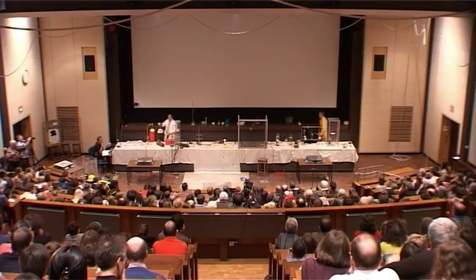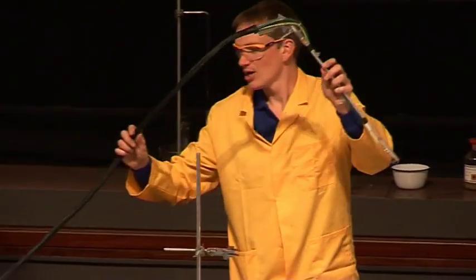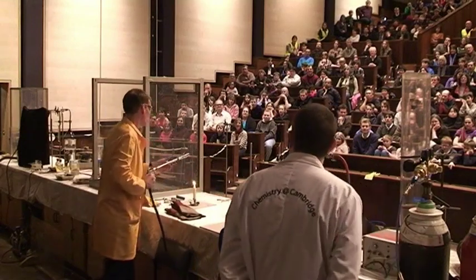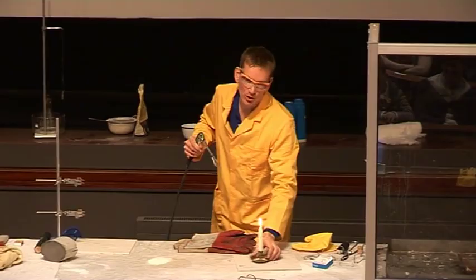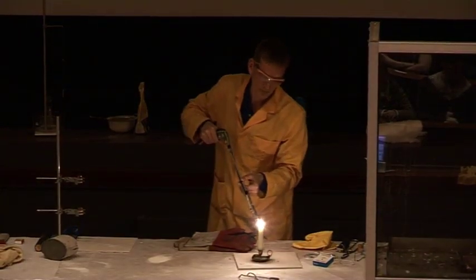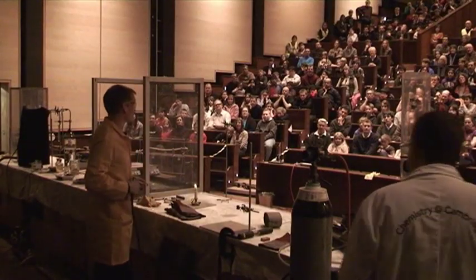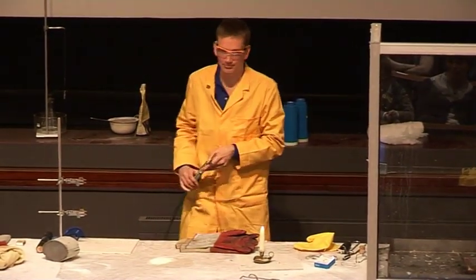Now, we have over here a special gun that will come in very handy later. And when I pull the trigger here, gas comes out. It's pure oxygen gas, and I'm going to see if I can light it. So let's try and light it with a candle. Well, it certainly doesn't light, but what it should be able to do is help the candle burn a bit more brightly. So the oxygen itself is not catching fire, but it does enable the candle to burn more brightly. So the candle is burning, the fats from the candle burn in the oxygen here.